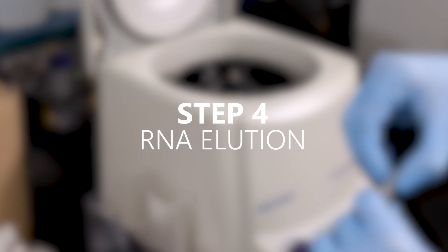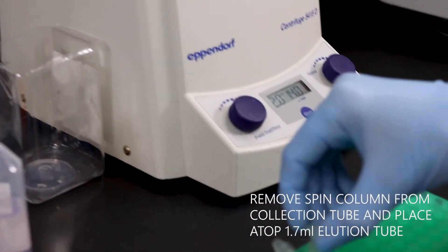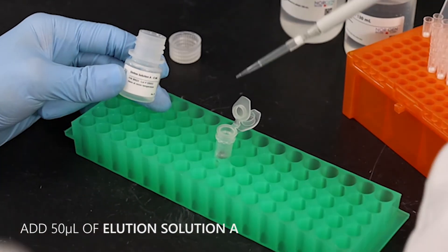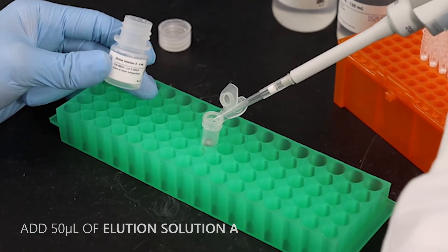Step 4. RNA Elution. Remove the spin column from the collection tube and place it atop a 1.7 ml Elution tube. Add 50 microliters of Elution Solution A.